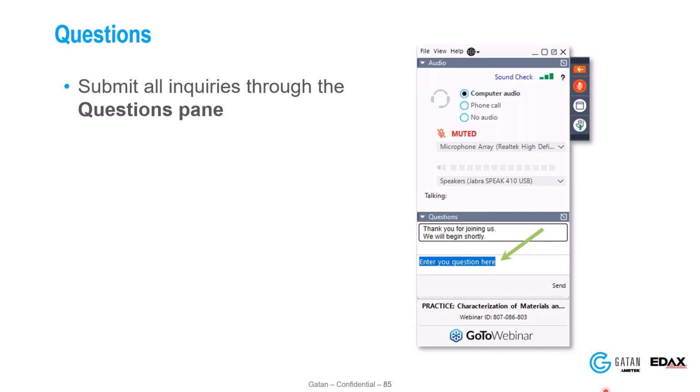The biggest practical thing for me is probably the sample prep, from when customers submit data and I just run it, whereas at other times I'd try to figure out a sample preparation method to improve things. I like to get to an indexing accuracy of 80 to 90% as a general threshold for difficult materials. Depending on the problem you're looking at, you have to decide what threshold is acceptable. When I have data that's 25%, I don't feel like I'm really getting an accurate representation of my microstructure. That drives a lot of my decisions, I think.